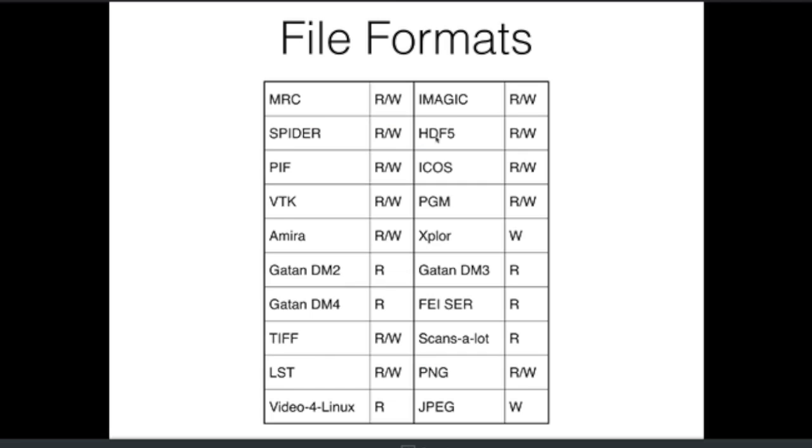This is just a list, for those who are actually in the CryoEM field, of the various file formats that we support. This isn't actually a completely exhaustive list. If you look in the wiki, you can find a complete list. But we basically support all of the commonly used file formats.